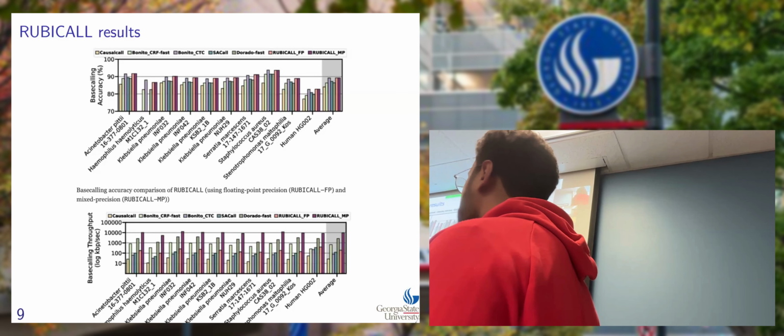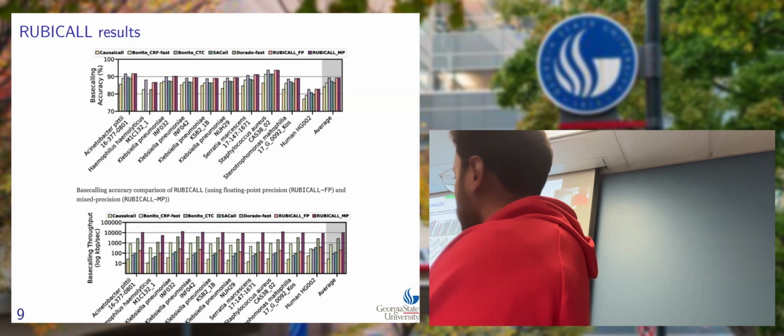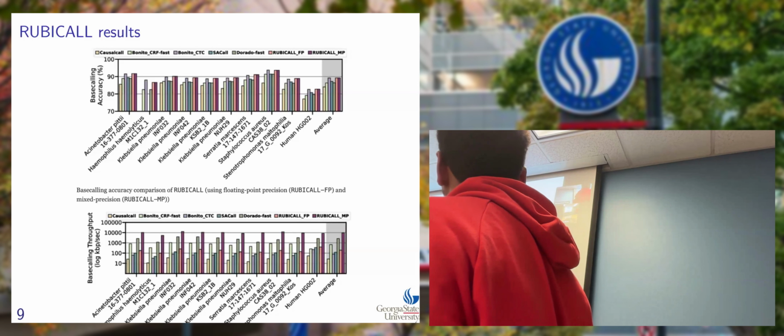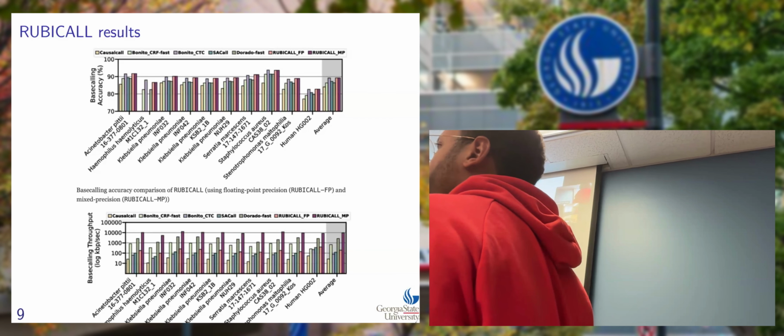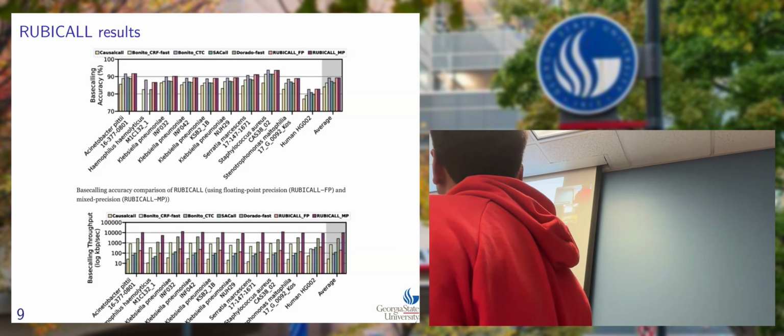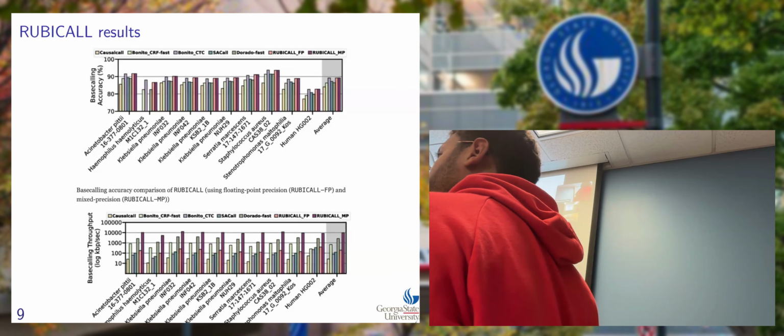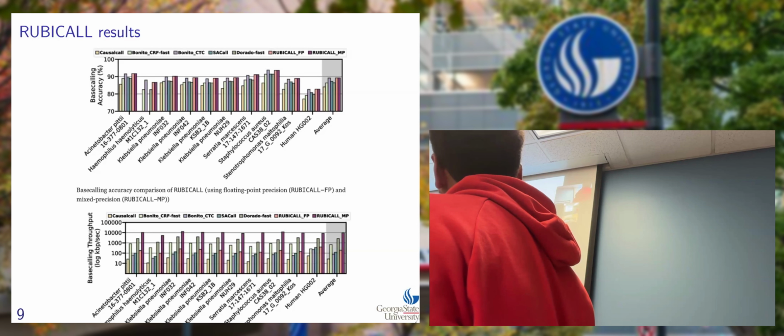For example, rather fast, faster than floating point. Yes. The accuracy is worse. Yeah, we need to look into the numbers. So with that decision, you can see the trade-off. Do you want to go with faster or higher accuracy? Can you combine both of them? The answer is simply no, because even if you change the dataset slightly, you can see this clearly.